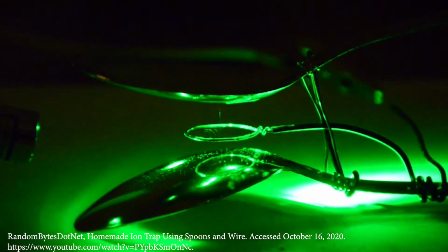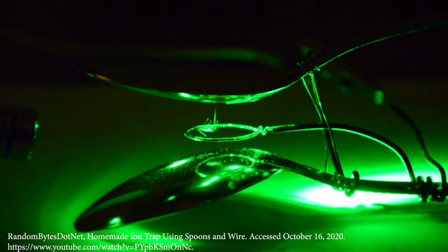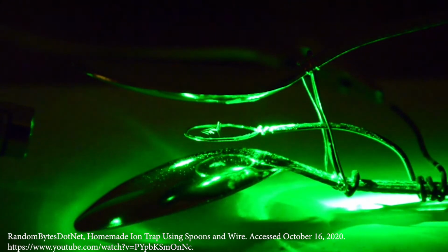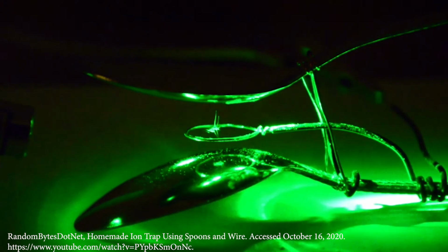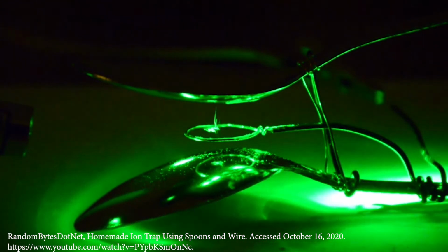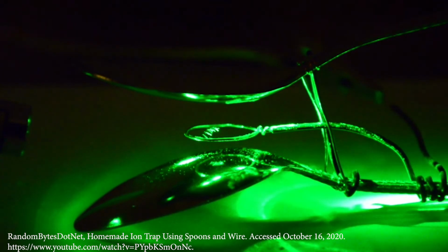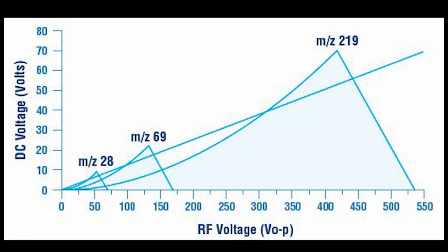Okay, you guys see that? You see the light? Those particles are moving up and down. They're trapped. Those flour particles are trapped in that electrical field by the quadrupole electrical field. Instead of racing around in circles, they are moving pretty quickly, but they're trapped in an oscillating motion in the field. Now, if he turns up the voltage, which he's about to do in a second, it will throw them out. It will eject them from the trap. In just a second, he's going to crank up the voltage, and they are going to fly out. There we go. They were thrown out of the trap.